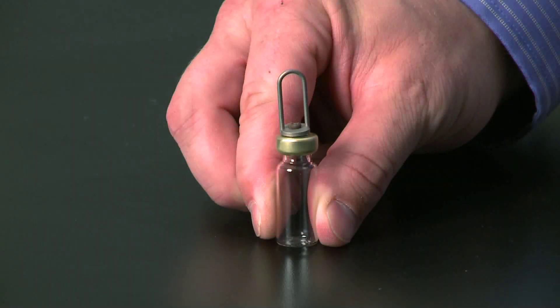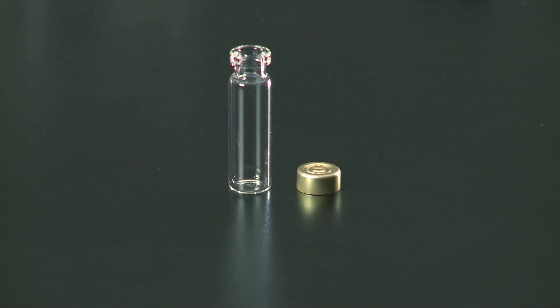Now the ampule is sealed and ready to go. The only thing left to do is remove all the fingerprints from the outside of the ampule, and now you're ready to load. The process is the same for the 4 milliliter ampule.